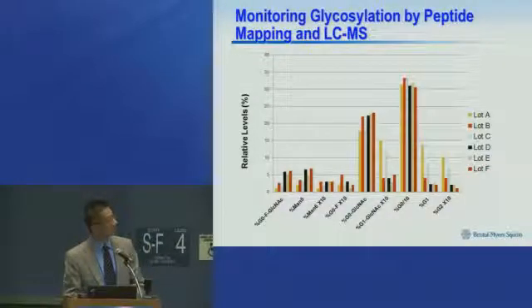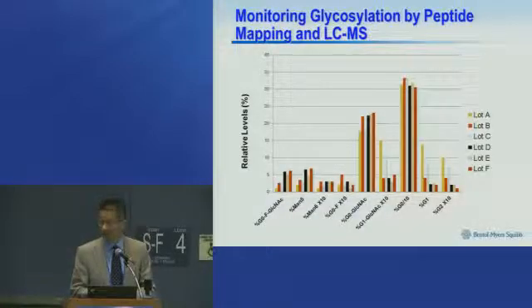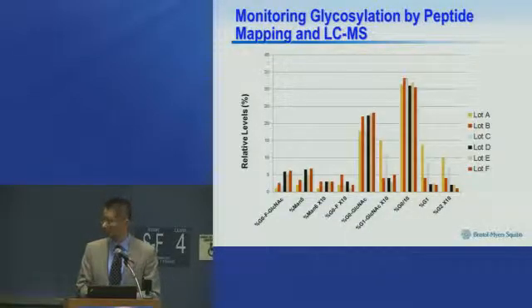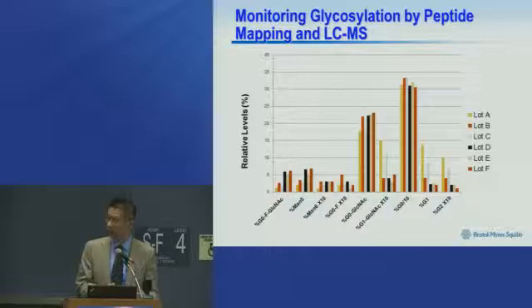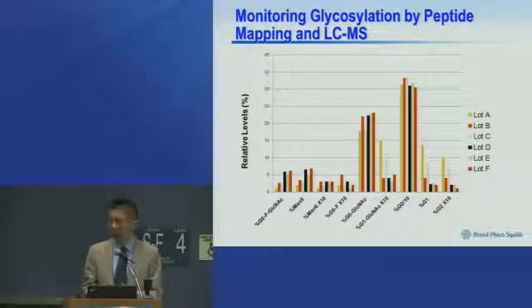This figure shows the different glycosylation patterns from different lots. That is something we need to figure out when we do comparability studies, but it's not always easy. And you do see differences. How much of a difference contributes to the end result is a totality of the data, and different assays provide different weight in your final determination.